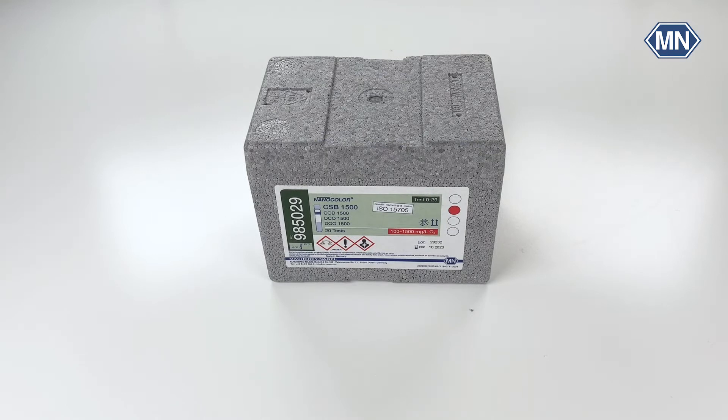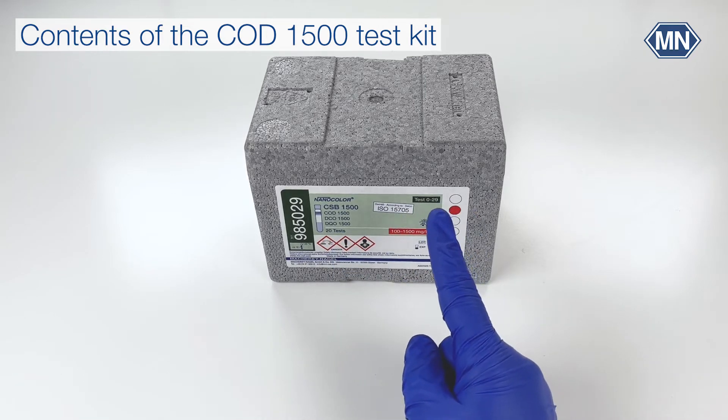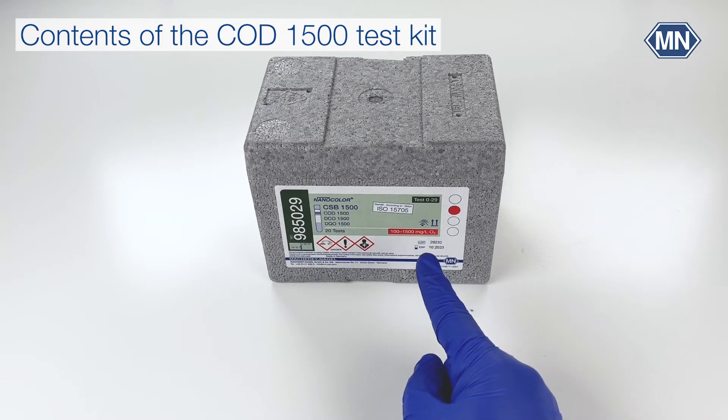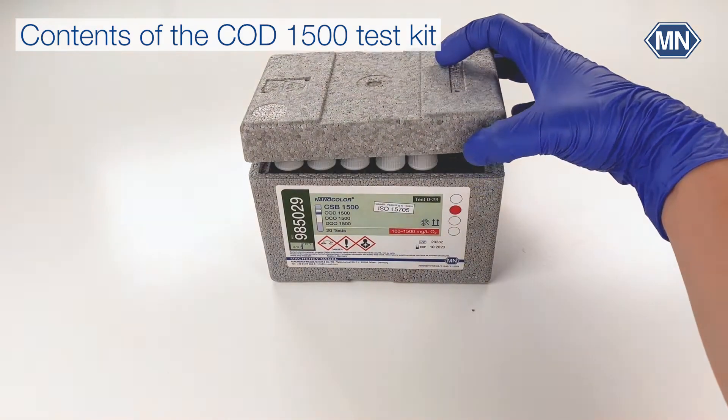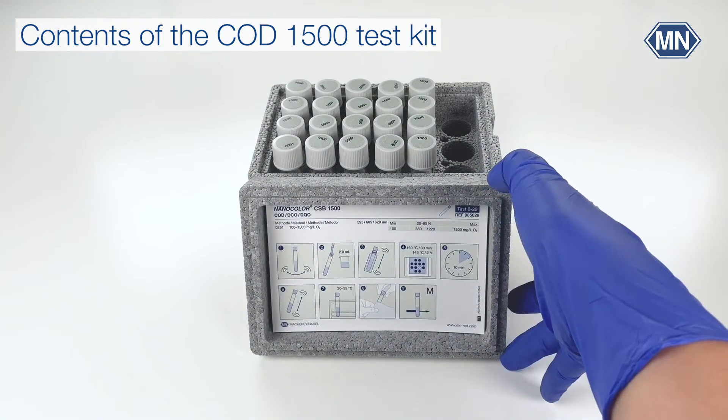All Nanocolor test kits are labelled with the parameter — in our case the COD — the test number, the measuring range, the batch, and the expiry date. You can find the pictogram instructions in the lid of the box.